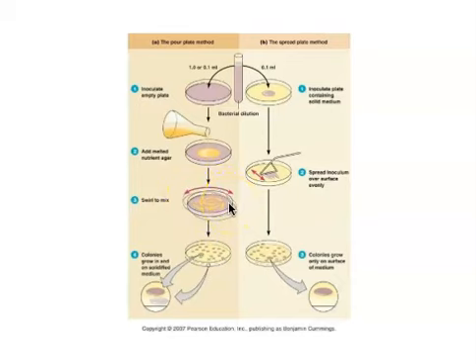Agar is produced as a liquid, and it solidifies as it cools. So by the time our plate cools off, some of the cells in our original sample will be down on the bottom underneath the agar. Some of them will be actually stuck within the solid agar, and even a couple of them may be growing on the surface.